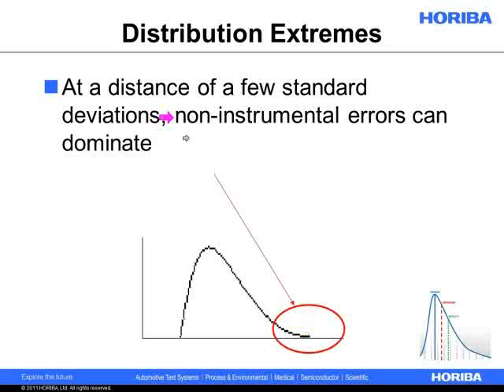It's really statistical errors because the number of large particles out here on the edge is so small compared to the number of particles out here in the body of the distribution that if your measurement length is too short, you may not see them in every possible scan, which means that the D99 value is going to flicker potentially from one measurement to the next.